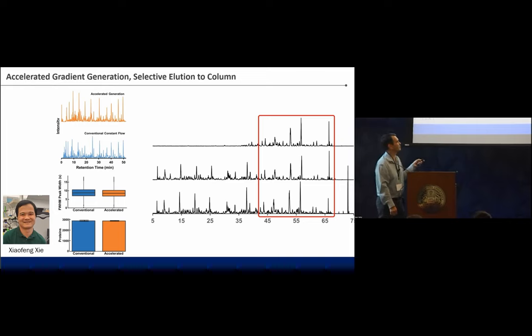And of course we want to get to, where's the low flow stuff? Maybe it's before that. Of course we want to get down to 1 nanoliter per minute, right? Look at that. So good. So even the best we're doing is in here somewhere. But is it worth that? That's a whole next level of pain, right? To do an injection. Yeah. But we didn't do an LC injection there. So that's the hard part.